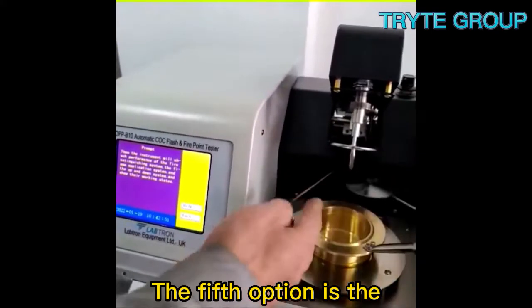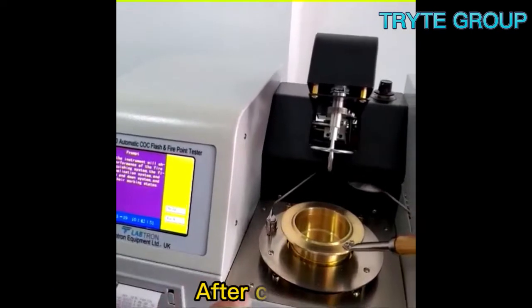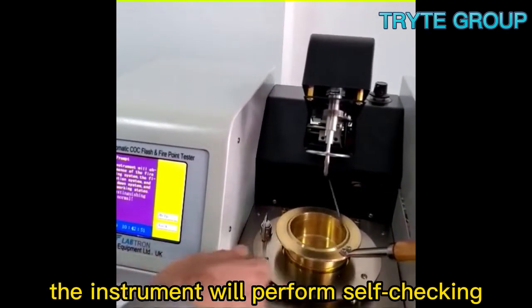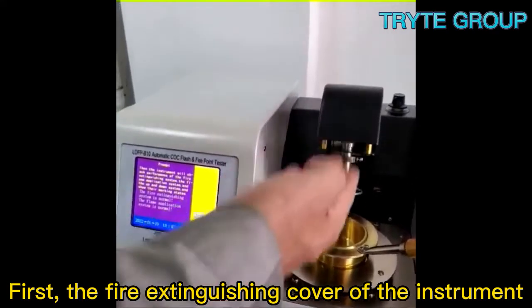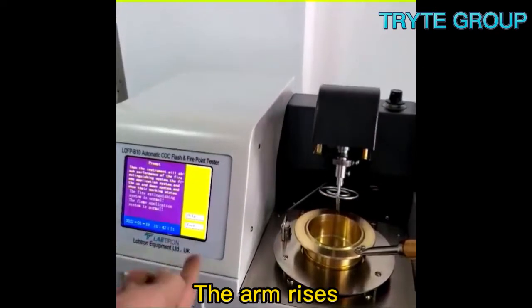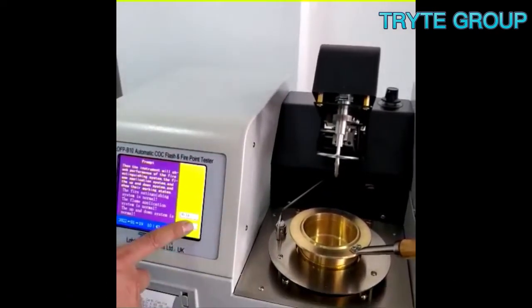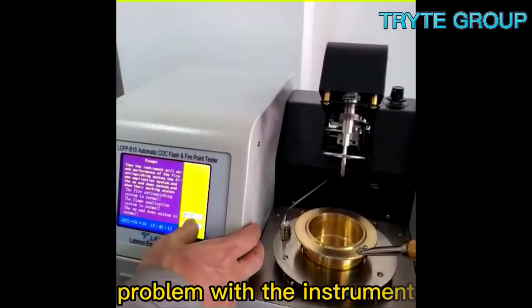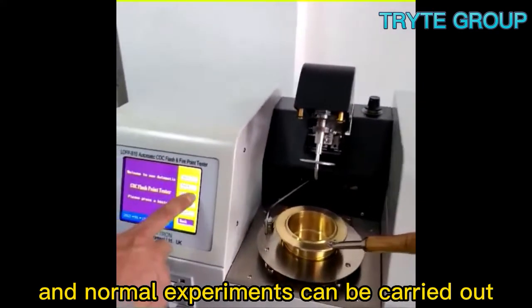The fifth option is the self-checking function of the instrument. After clicking, the instrument will perform self-checking. First, the fire extinguishing cover of the instrument — the arm rises, and after all functions are completed, it proves that there is no problem with the instrument and normal experiments can be carried out.